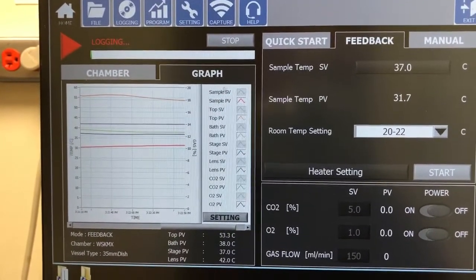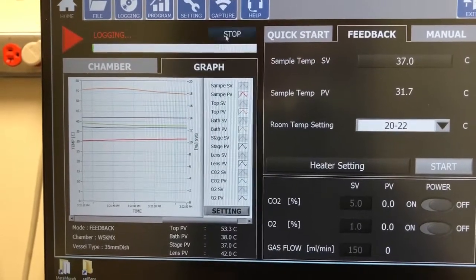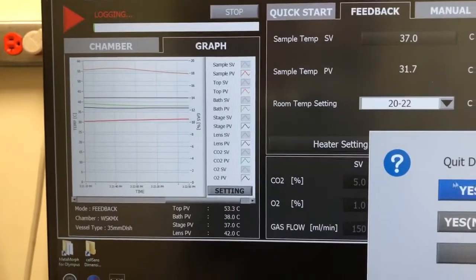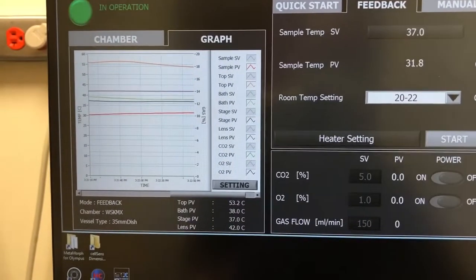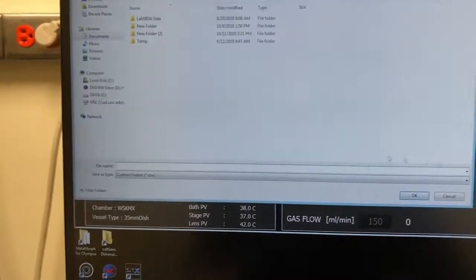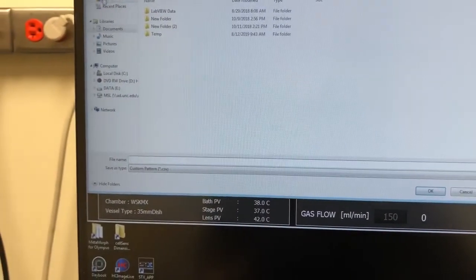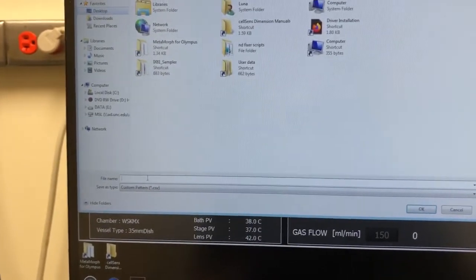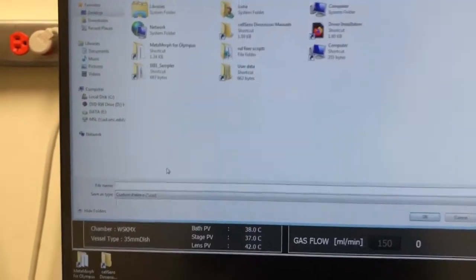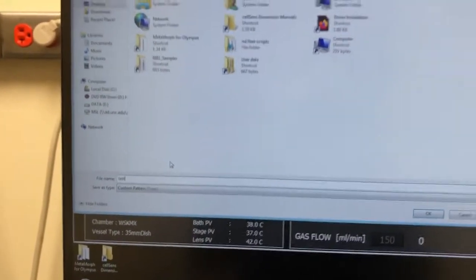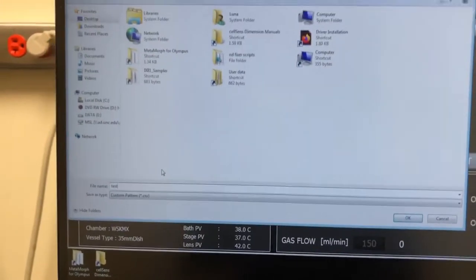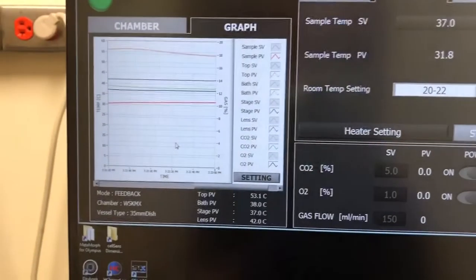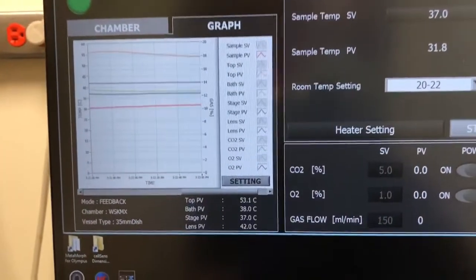So I'm just going to stop this and actually save the data so we can take a look and see how it looks. I'm just going to put it on the desktop really quickly. Call it test.